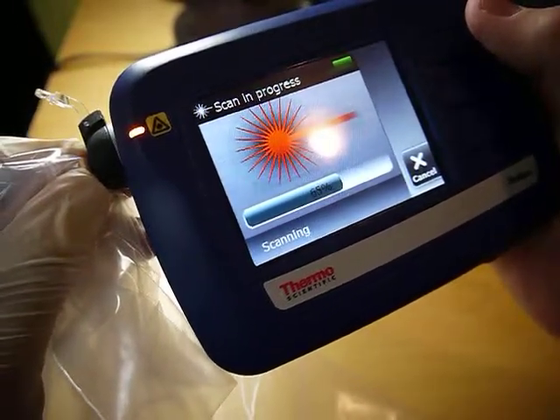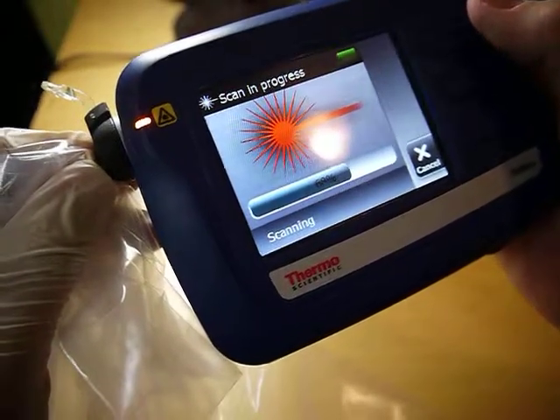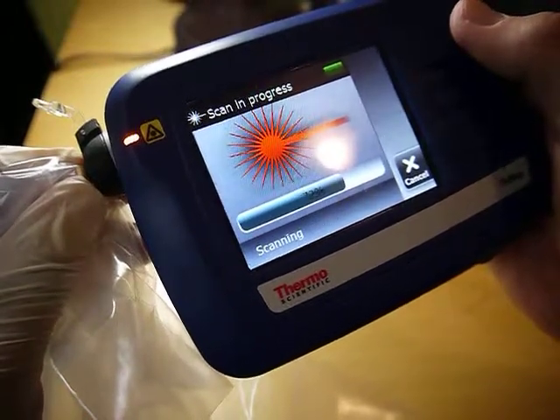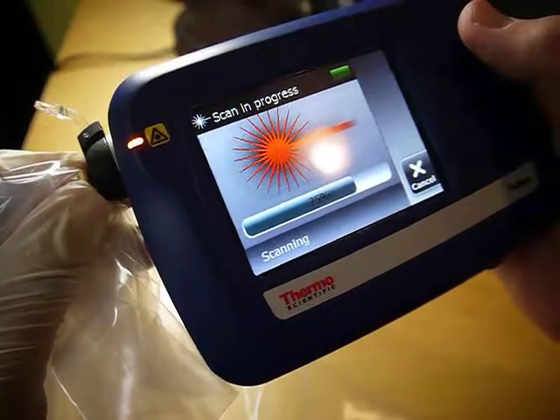In the previous video I showed you the waveform. I have tested this one before and I know that this is in the library. I haven't had to break the pill up — it's just a full pill. So let's see what we get.